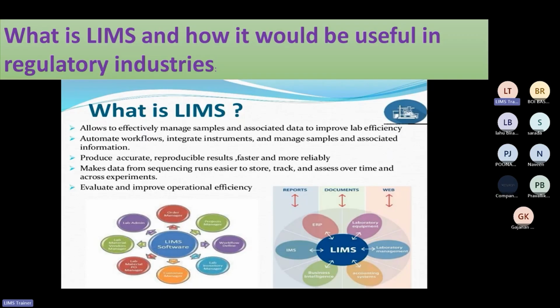But when you are using this particular LIMS software, it is a task of just a second. You just enter that particular batch number into the software, and the data related to that batch will be readily available. You can take a printout of that data, you can share that data. So many possibilities are there. This software helps to evaluate and improve the operational efficiency. So this is the role of the software.